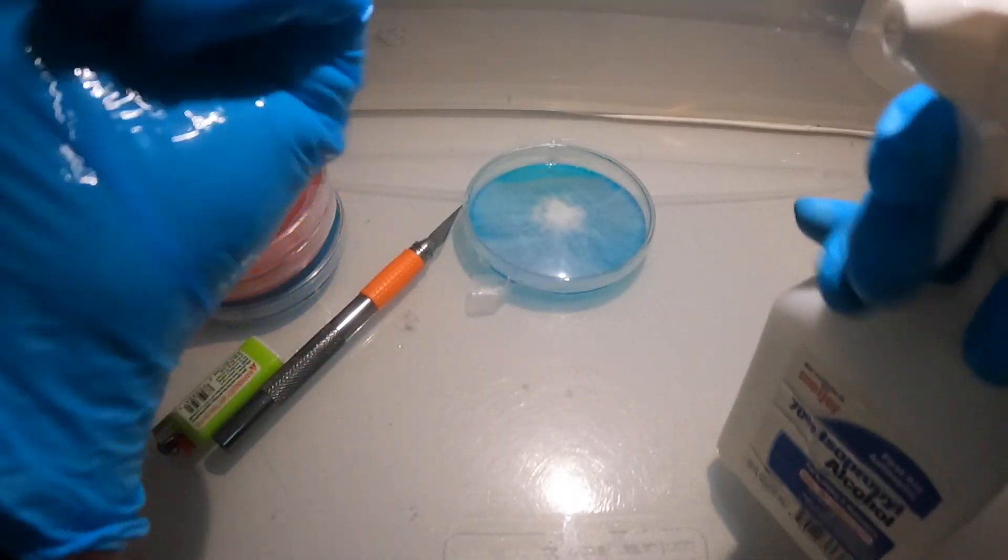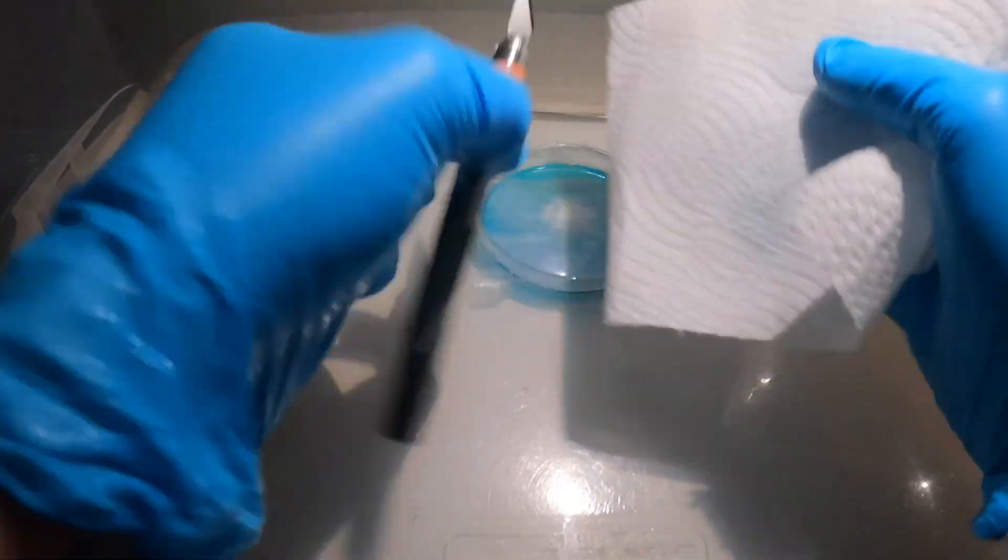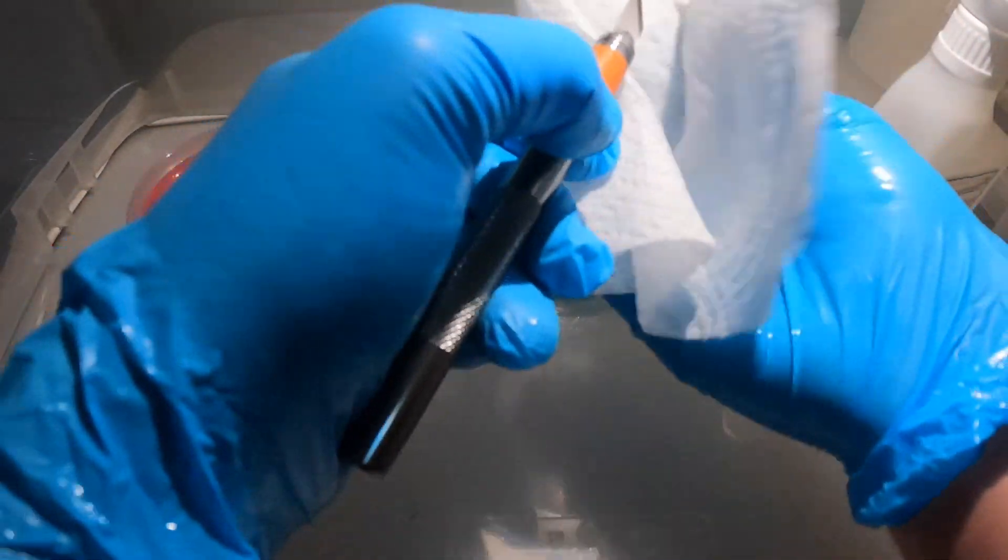After one to two weeks your agar dish should be fully colonized, and if anything looks weird you can isolate the healthiest looking mycelium onto a new agar dish, which I will be showing you right here.